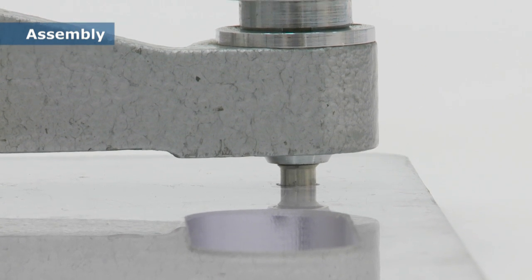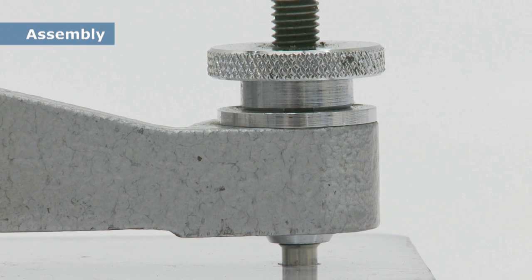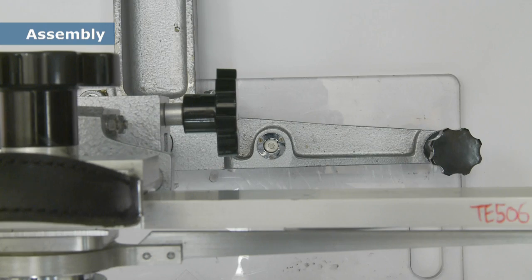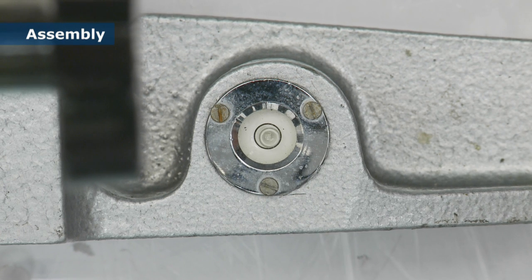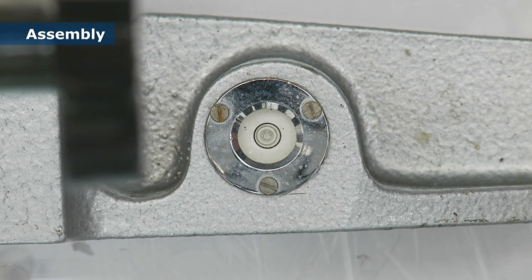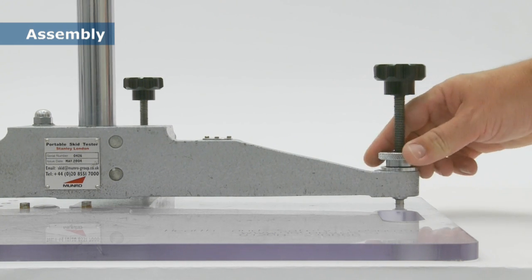The feet should be adjusted so that the pendulum frame is set as low to the floor as possible. The pendulum is then carefully levelled, taking care to avoid parallax error by looking down on the level from directly above. When you're sure it's level, the locking nuts on the feet need to be tightened.